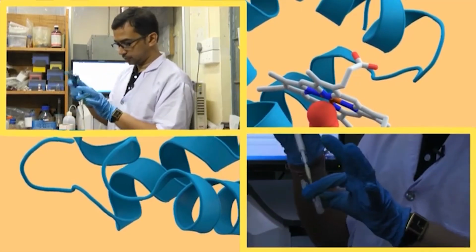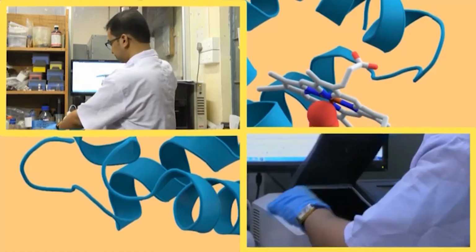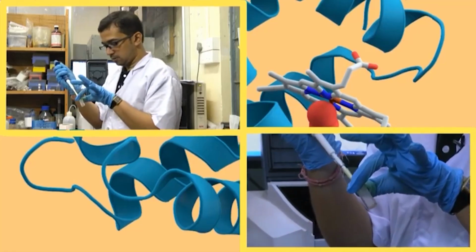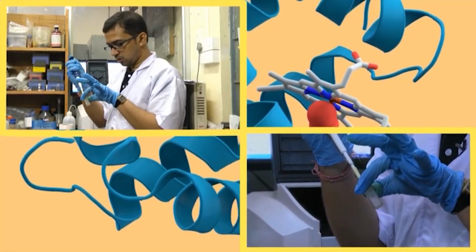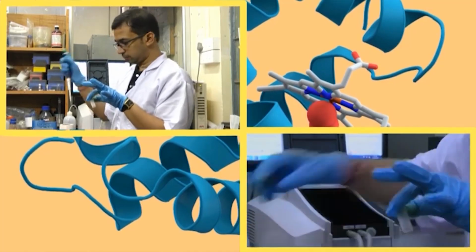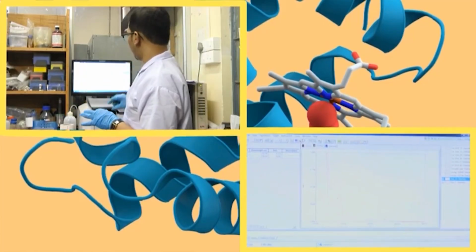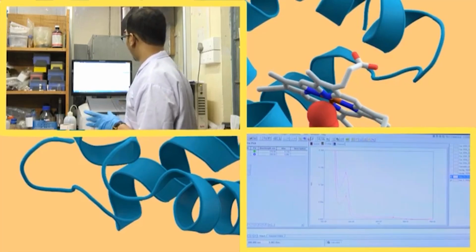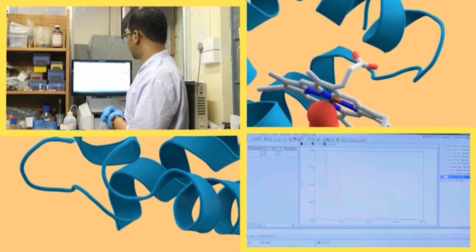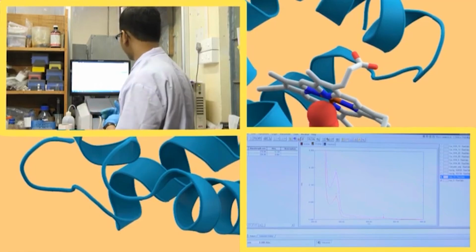of HSA. I am adding it here and mixing it thoroughly. In a similar process, we are going to do this auto zero, and after auto zero, we are keeping the start. Okay.